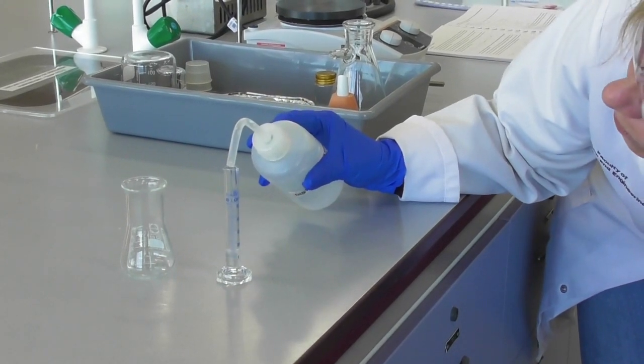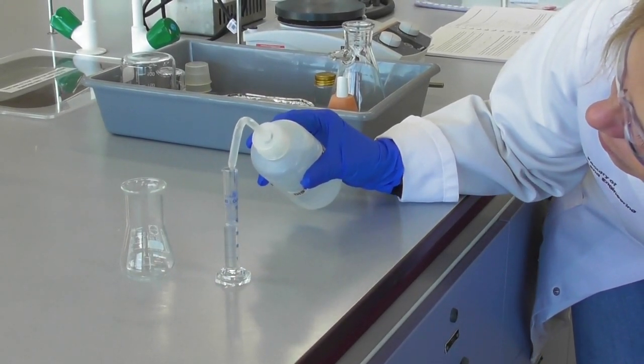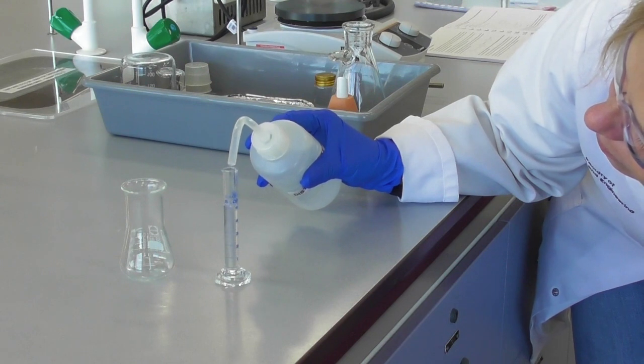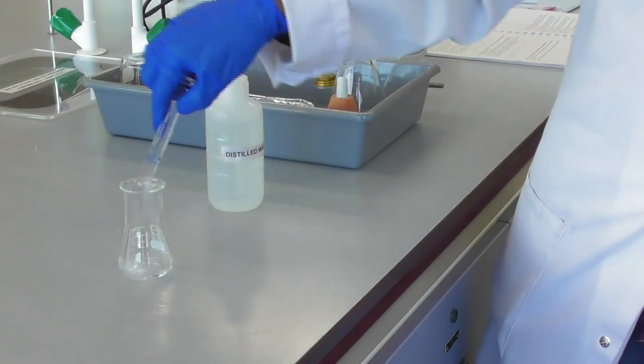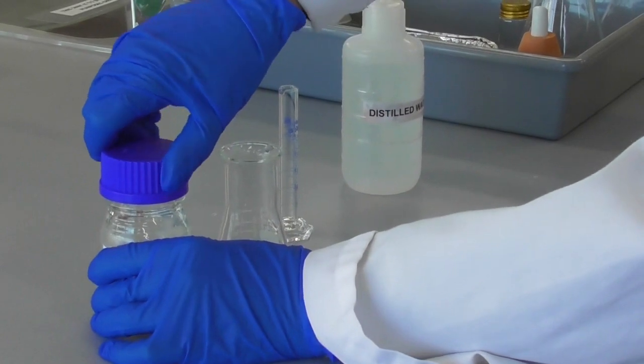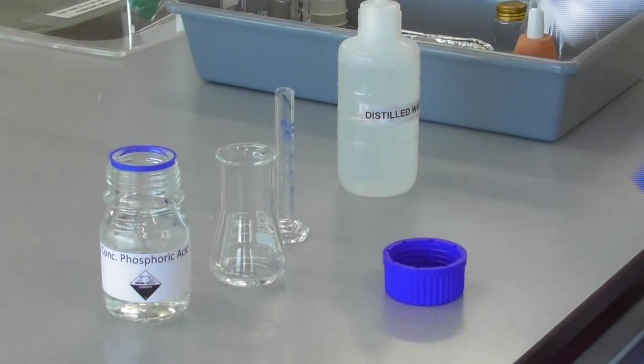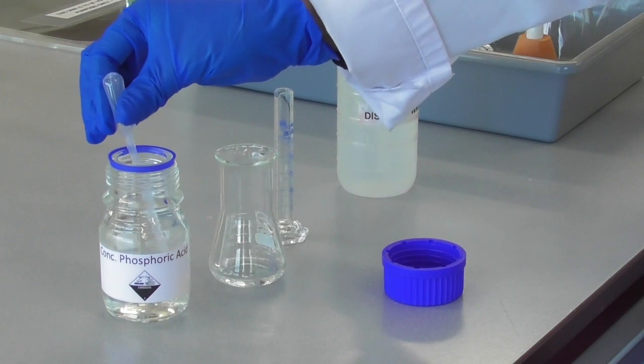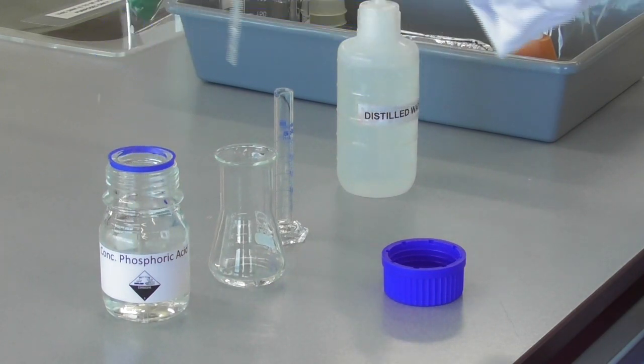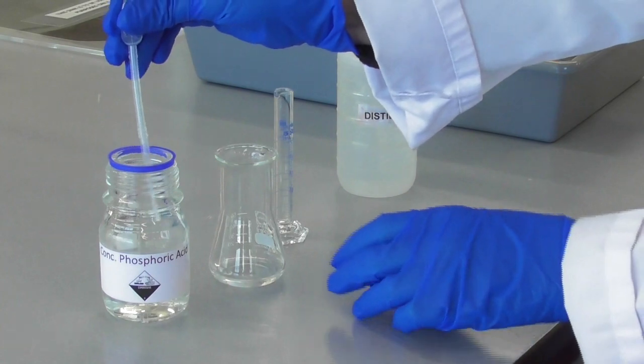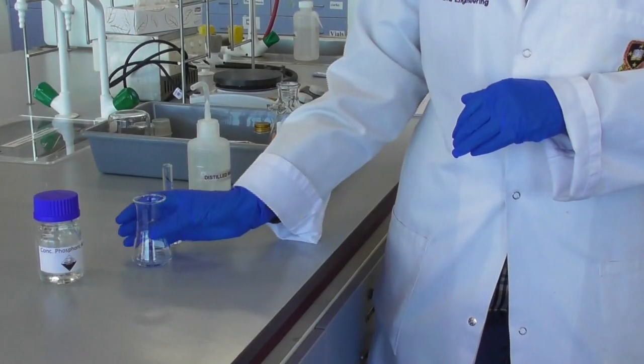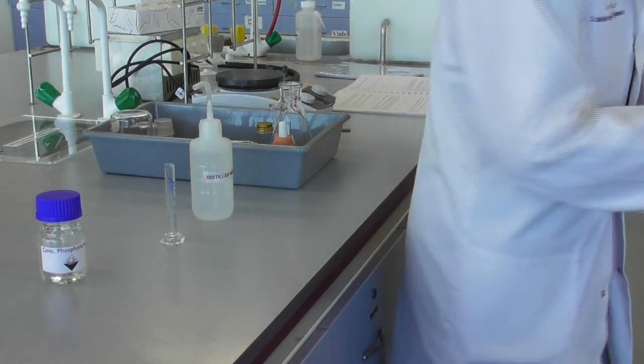First I measure out 5 ml of distilled water and pour this into a 50 ml white neck flask. To this flask I add 8 drops of concentrated phosphoric acid and then I take this flask with the solution to the fume hood.